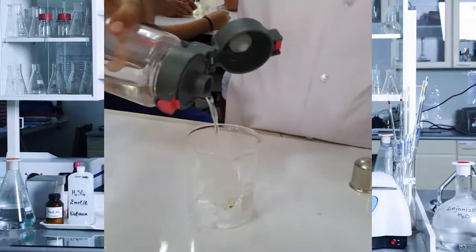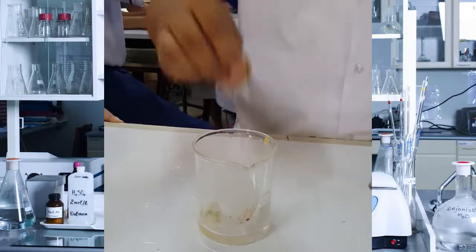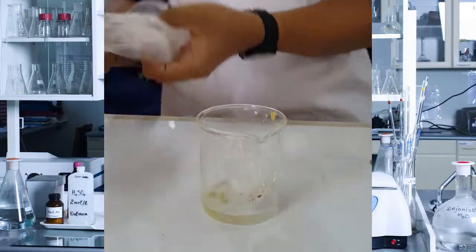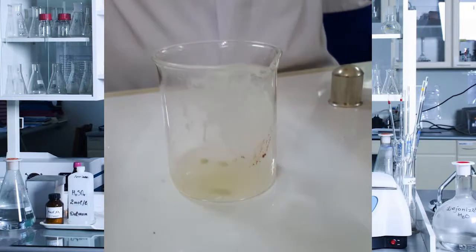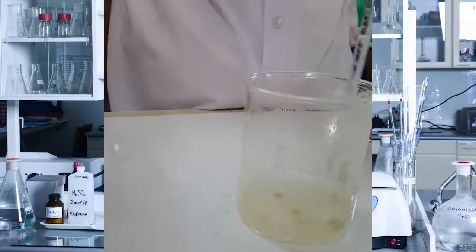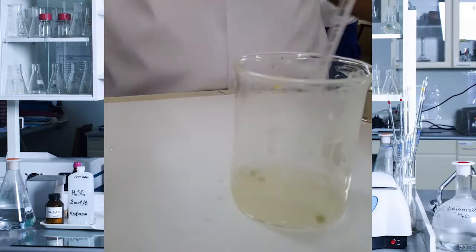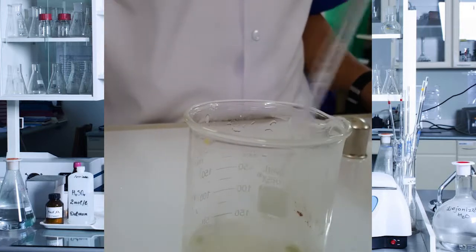In this experiment, we used calamansi and water. We mixed the substances in a beaker and stirred it with a stirring rod. As seen here, the seeds and pulp of the calamansi can still be seen by the naked eye.